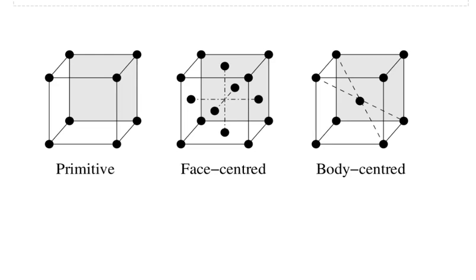Right, I'd just like to introduce experiment 43, which is the determination of crystal lattice type, practical, that some of you still have to do. I won't deal with all of the prac here, I'm just going to very briefly introduce it. There's a lot of detail in the prac manual about this. Please go through this and make sure you understand all aspects of it.